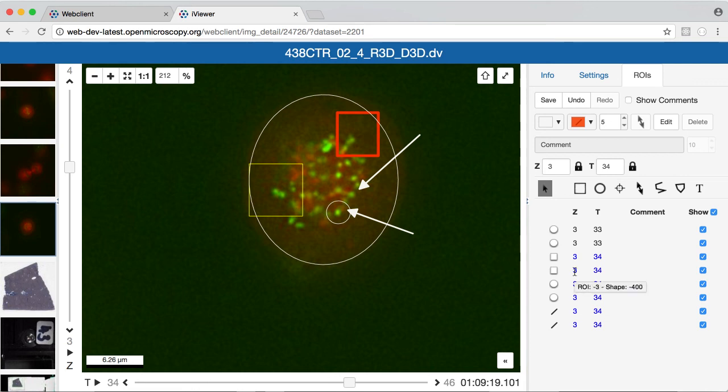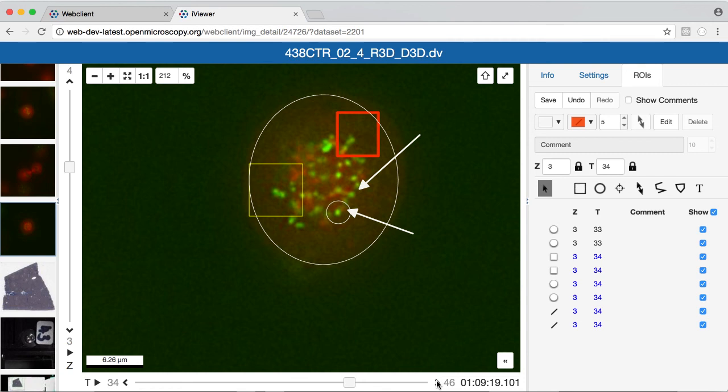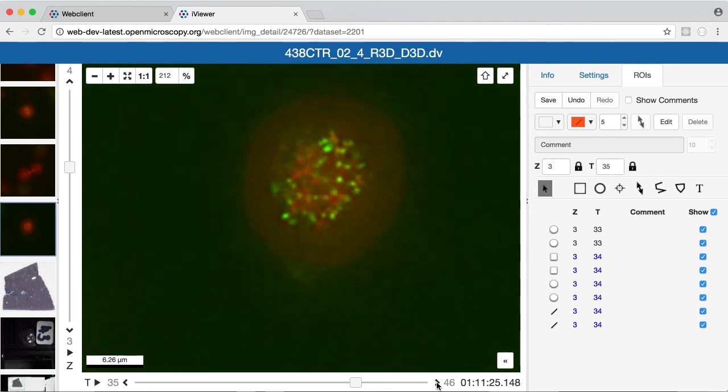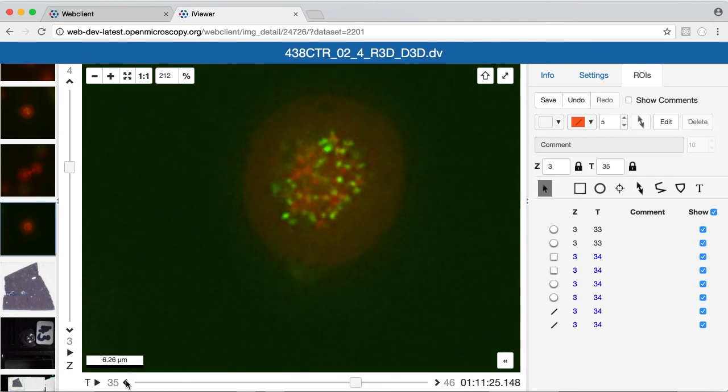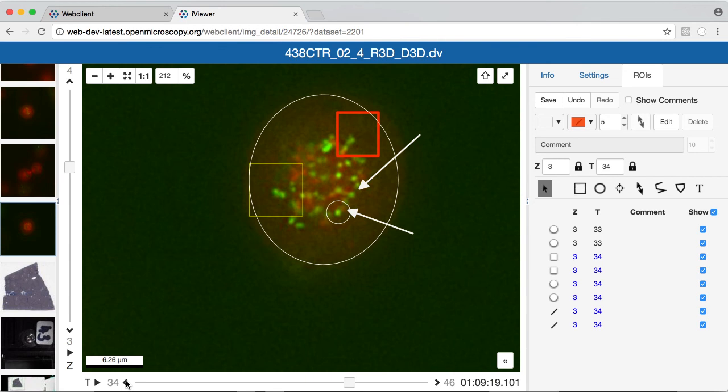You'll see that each of the shapes I've created by default is linked to the currently selected z and t index, so by moving through time I only see those shapes when I'm on the selected plane.